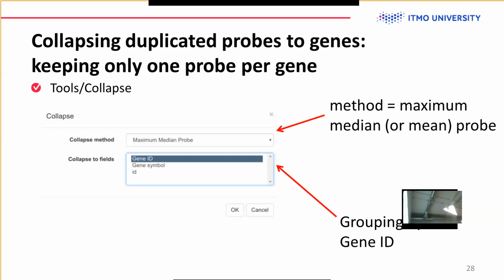And again, here usually, at least at the beginning, you want to go for the results that are very pronounced and that you can trust completely. And then if you don't have these results, you can try to understand what's more fine-grained thing that can go different, but that requires much more data support. We should find some other data sets and so on.